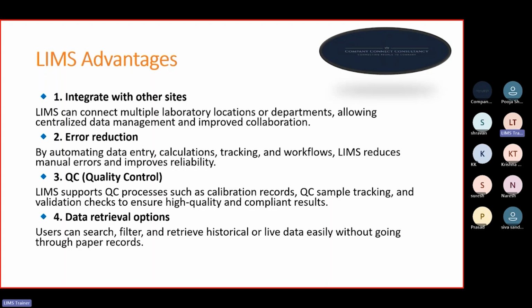They have two options. They will centralize the system, or they will do a trial run for one site only. First, they will implement that software at one site. They will see if it is working smoothly or not. If it is working smoothly, after that they will implement the software at multiple sites. Okay, but let's say they don't want to waste time. They just want to centralize the system and implement it at once. So now what will they do?